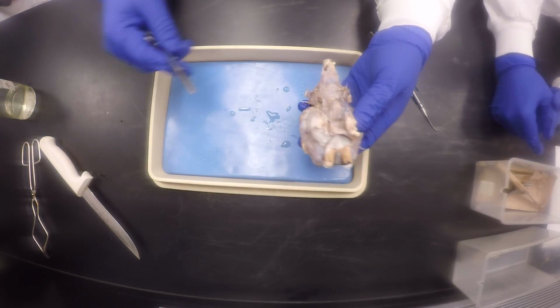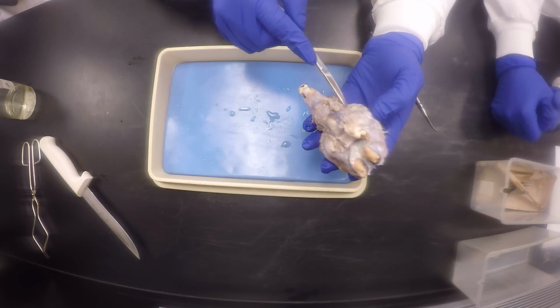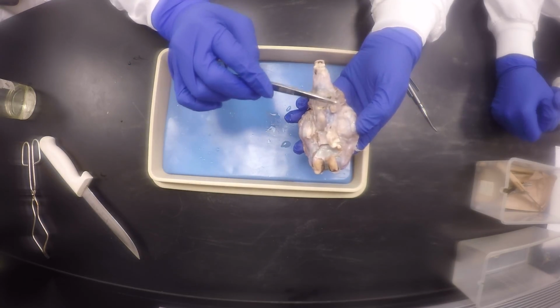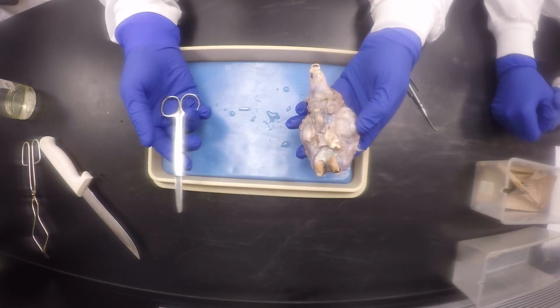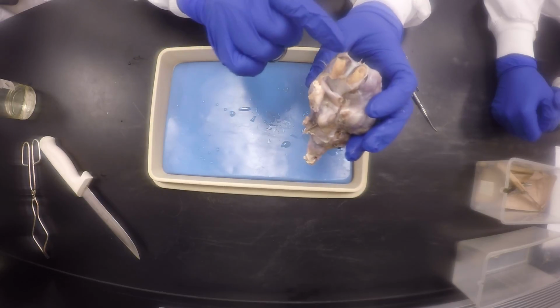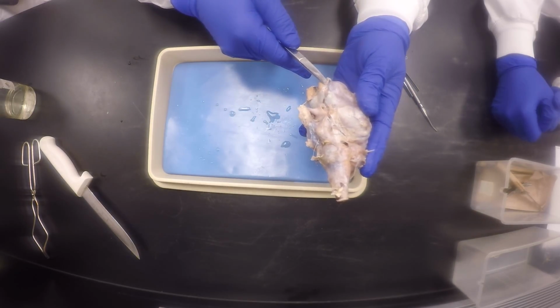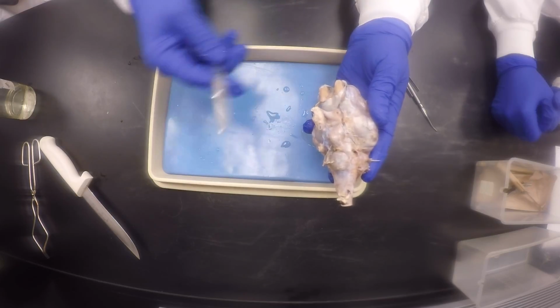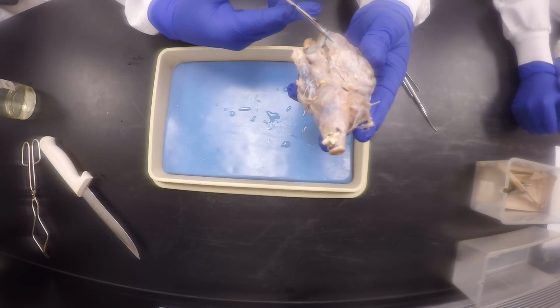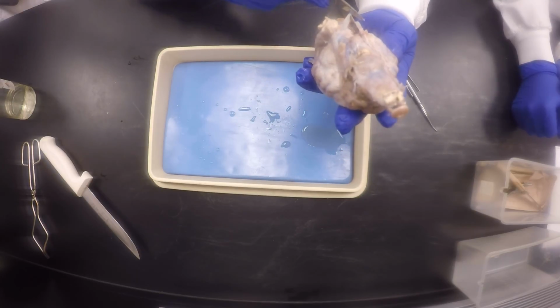So the first order of business is to remove the dura mater. We cut around like that, and we leave the dura mater here. As you can see, if we remove it here, we're going to remove all our cranial nerves, and that would not be good. So we start right here at the olfactory bulbs, and we already get an opening, so we use that, and then we do this here. Well, this one is already cut over here.